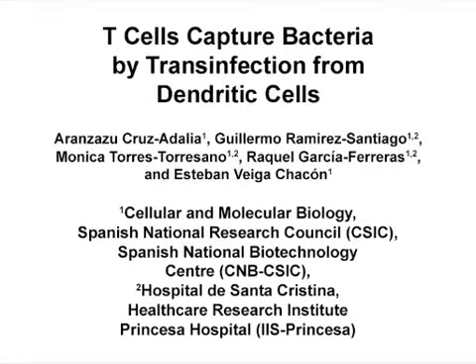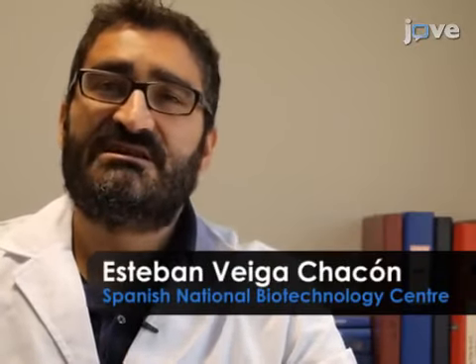The overall goal of this procedure is to quantify bacterial CD4 positive T-cell transinfection using a mouse cell model. In vivo, some pathogenic bacteria, such as Listeria monocytogenes and Salmonella enteritidis, are able to infect T lymphocytes and modify their behavior. However, in vitro, T cells are not easy to infect.